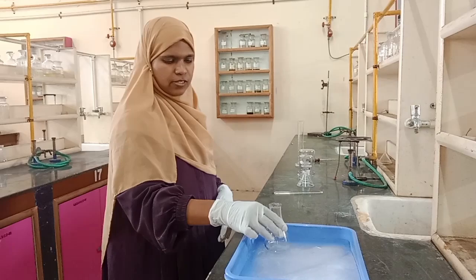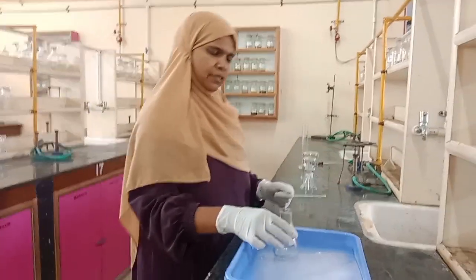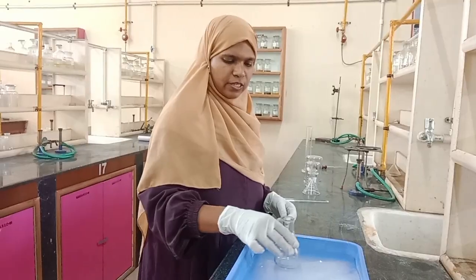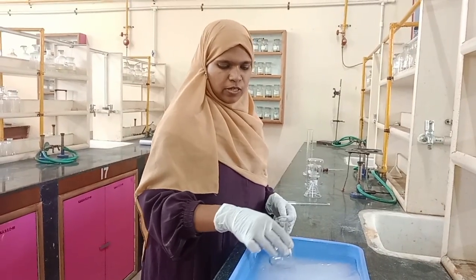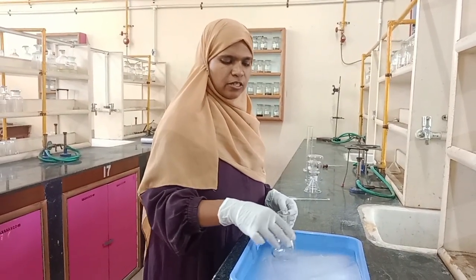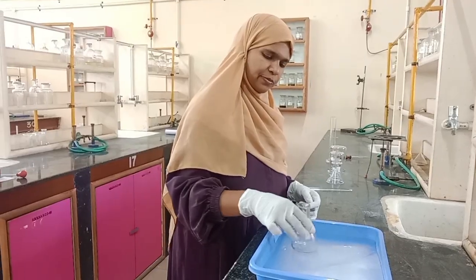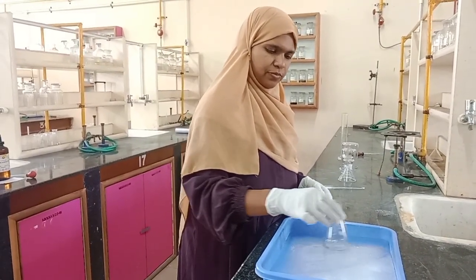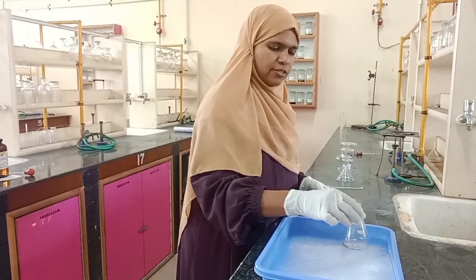After the temperature has come down, you can add concentrated HNO3. Then this solution is the nitration or nitrating reagent. The temperature slowly goes down.